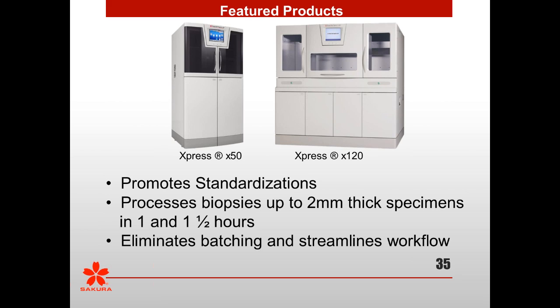That was over a 60% saving in volume of solution from moving from conventional to rapid processing. It depends on what you're paying for these solutions, but we did see an appreciable drop in cost of reagent, and more importantly, the big savings in cost for us was removal of those hazardous solutions, which everything in my location and my experience here is that everything but water has to be barreled and taken out by a hazardous waste hauler. So reducing from 6-point-something gallons on a conventional processor to 2 is a big savings. You will have to do that calculation yourself, and I do. You should calculate and incorporate into that calculation the amount of fluids used and the disposal of your fluids. I have not seen an adverse effect of using a proprietary reagent pack on the Express.